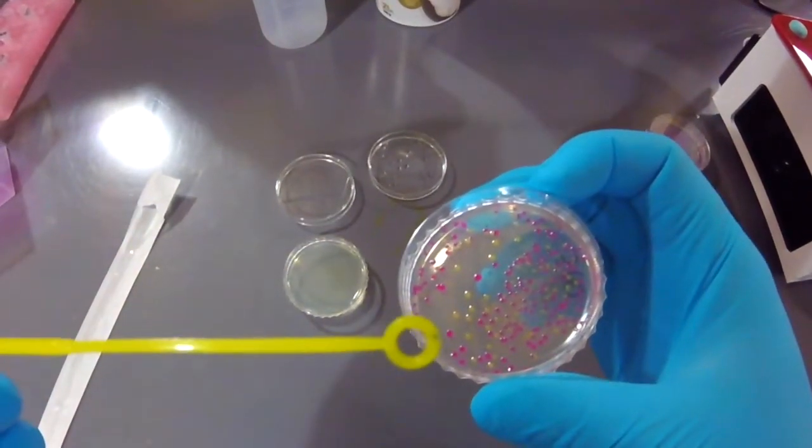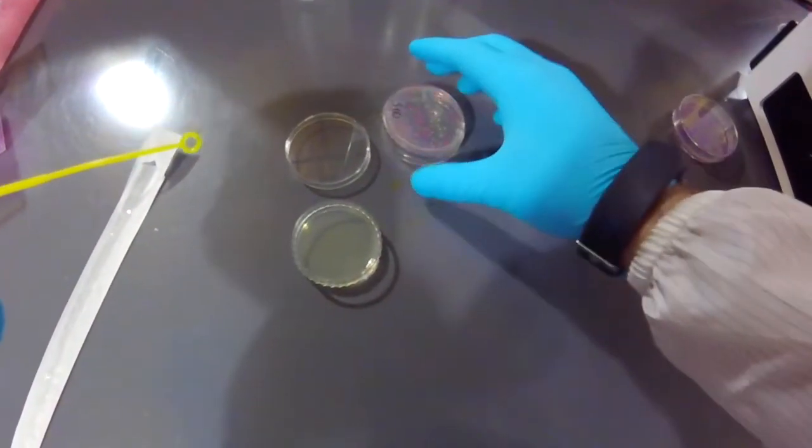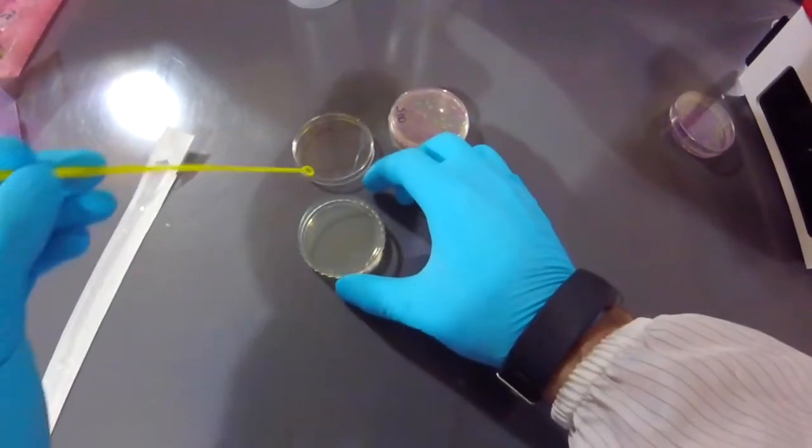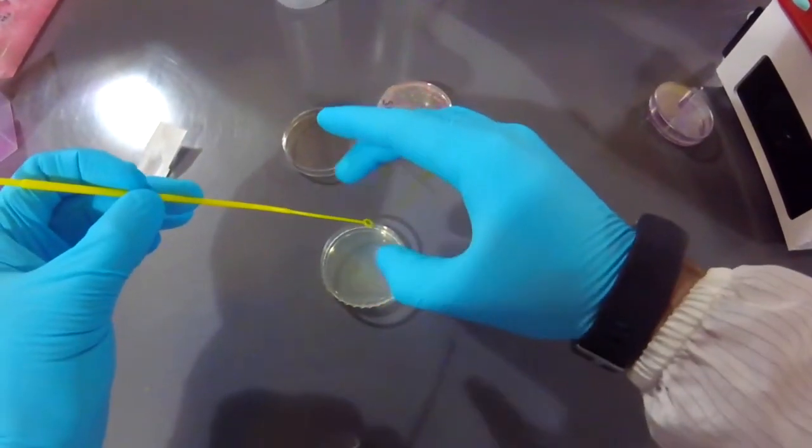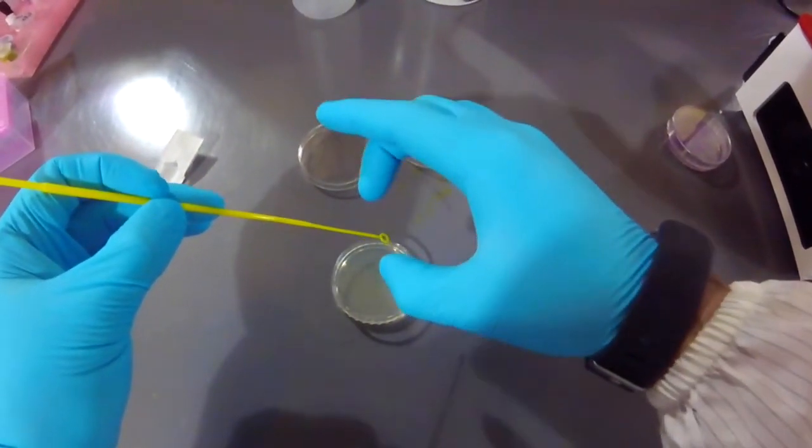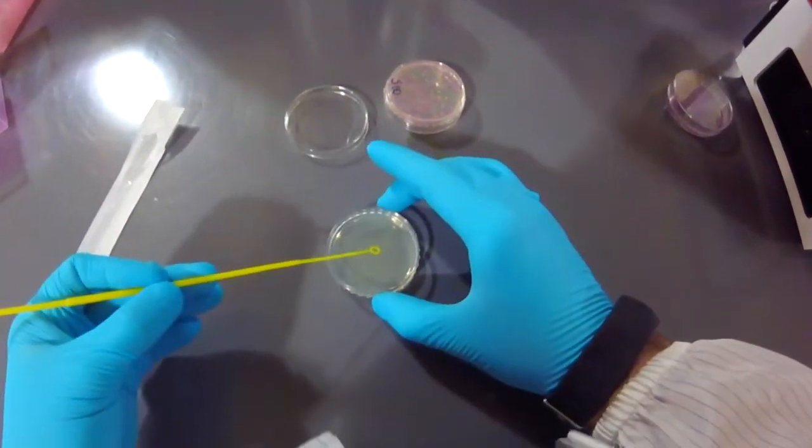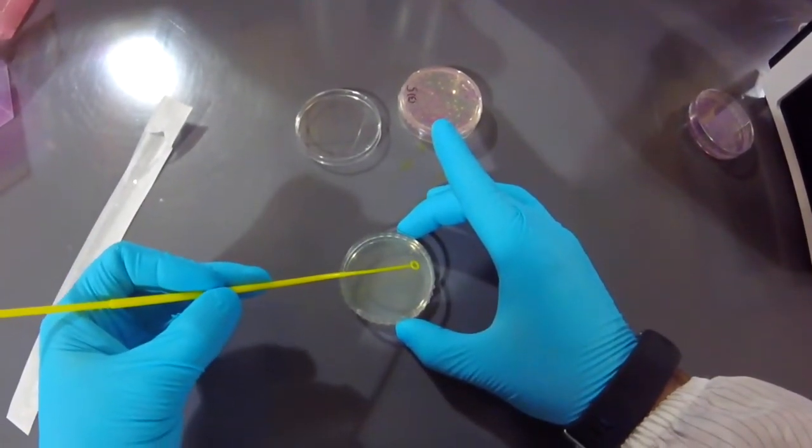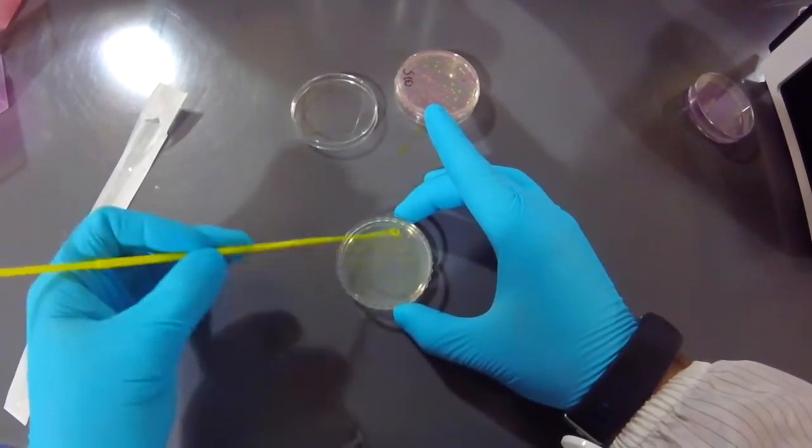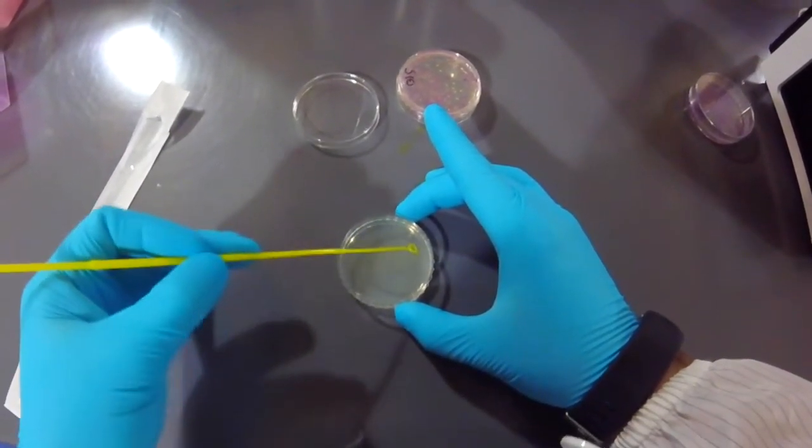So I touch it, you can even see it at the end of the loop here. So this is going to make up my first line, and I want to make sure that I don't touch the sides of this, because I'm going to use this clean sides for the second and third streak. So I'm going to keep it at a bit of an angle, and very lightly I'm going to do my first line, so I'm just going to go back and forth a little bit.